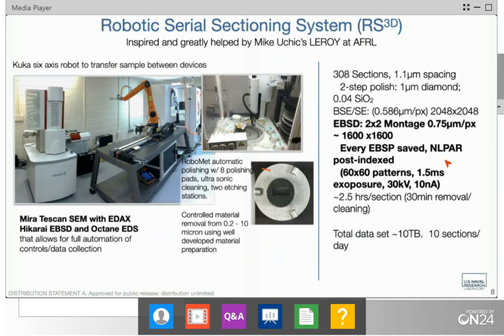But by using these fiducial marks, we get our accuracy down to about 10 microns of repeatability. I'm certain that with a little bit more work, we can probably get that further collapsed. I think 1 micron of accuracy is certainly within our grasp, but it does require a little bit further redesign of how these pucks get fixed to the stage, so that we have that very accurately replaced each time.